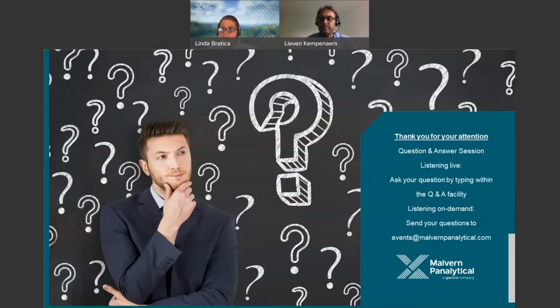How to decide on WD or ED? Is it only on sample throughput, or do sensitivity and elemental concentration also matter? Yes, WD or ED depends on the elements of interest.